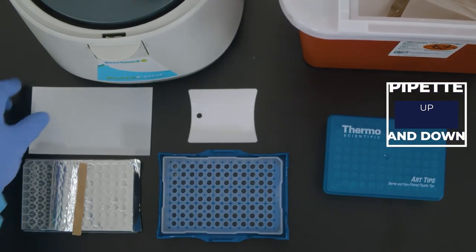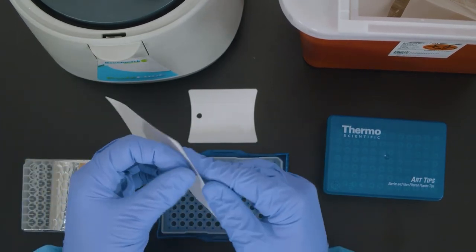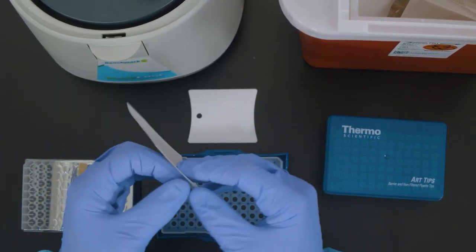Do not add a blank or template to the negative control. It should stay as 45 microliters of MasterMix only to test for contamination.